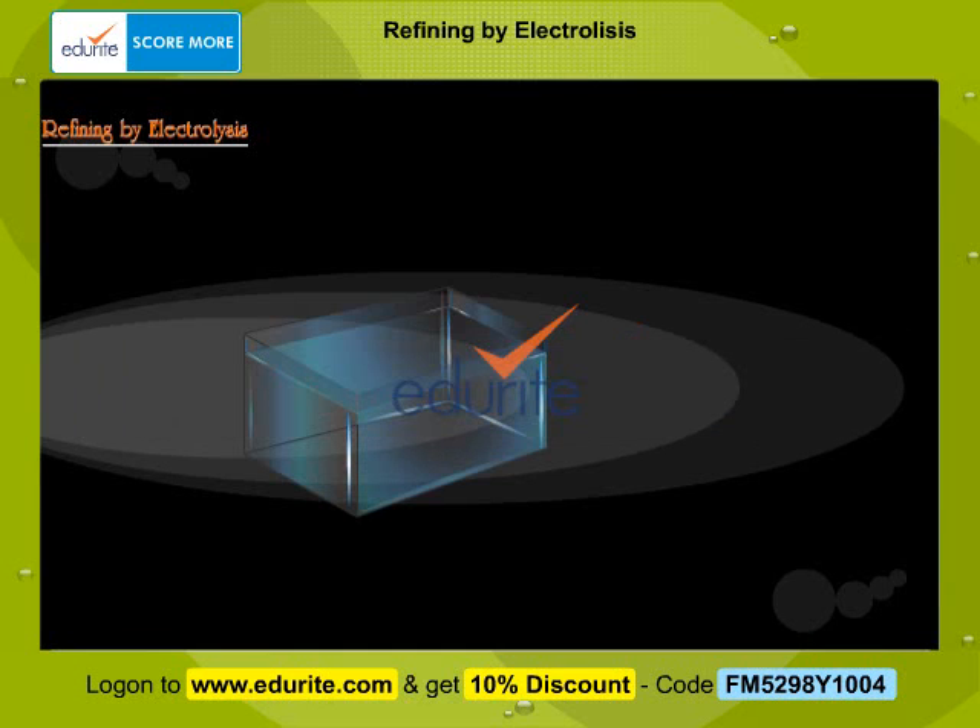You will now be viewing a demonstration of electrolytic refining of copper. The apparatus required for refining is displayed here.